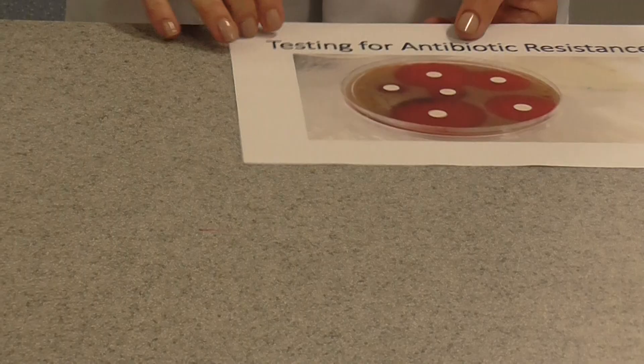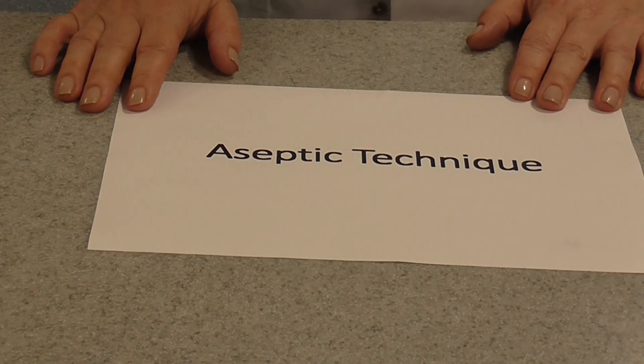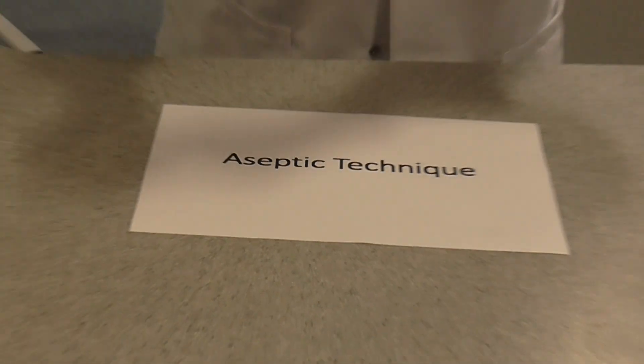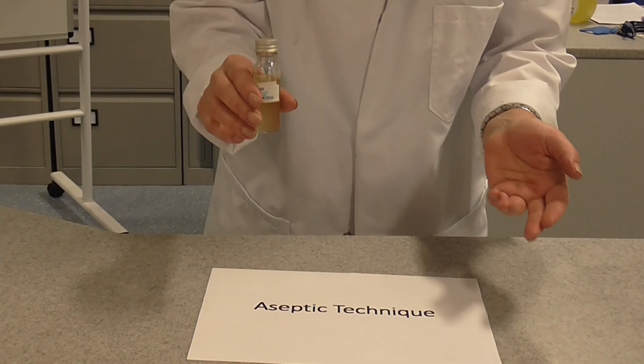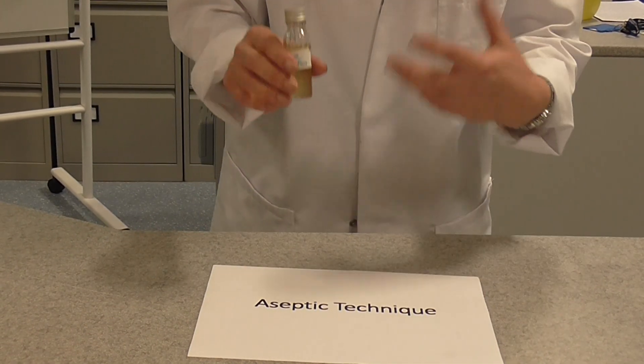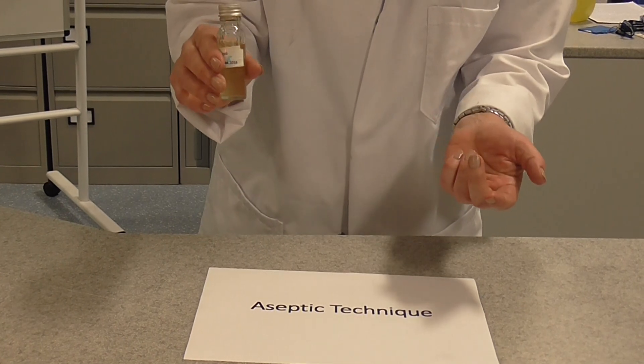Because we're working with live bacteria throughout this practical, we have to use what's known as aseptic technique. These are techniques that we use to firstly prevent our culture from becoming contaminated with bacteria from the lab, but also to prevent contamination of the lab and myself with bacteria from the culture, which could potentially be quite dangerous.